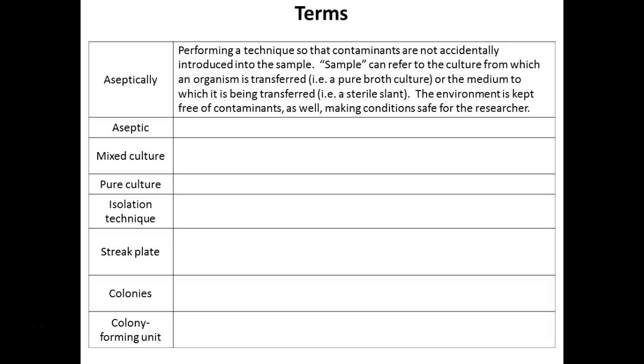We don't want your sample to contaminate any of your stuff, which is why once we actually start working, we'll put our notes in our sleeves so that if we do have a spill, which of course happened yesterday, and will probably even happen today, because we're beginners, right? And that's going to happen. Let me know, right, if you spill that broth culture that says mixture. That's a lot of microorganisms. We need to clean it up properly, right? Please try not to. But if you do, right, let me know, and we'll clean it up.